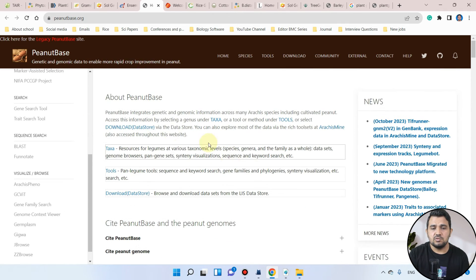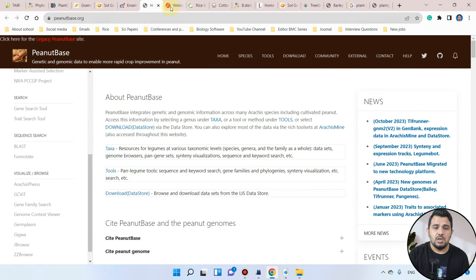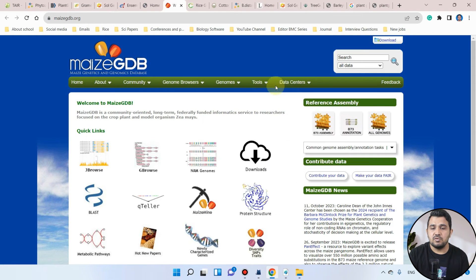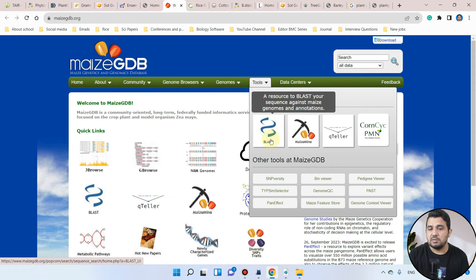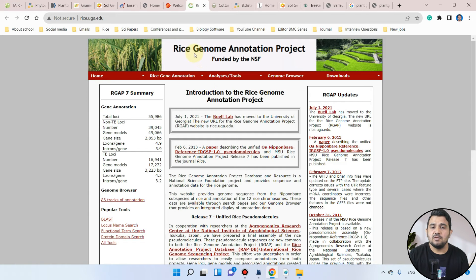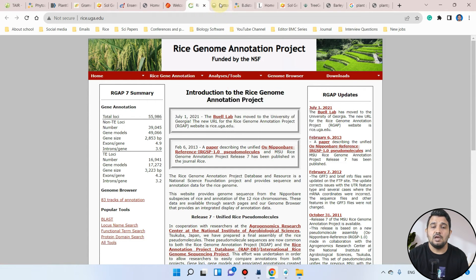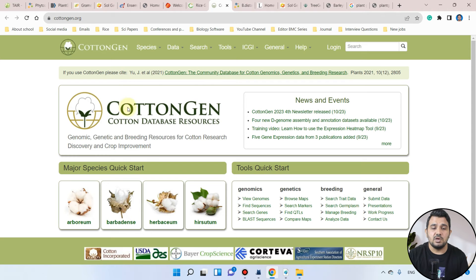We will also be using MaizeGDB, the maize genetics and genomics database, again using its BLAST tool. We will also be using the Rice Genome Annotation Project, where we can use the BLAST search tool. If you are searching for protein or gene families in cotton, you can use CottonGen, the cotton genome database resource, and again we will be using its BLAST tool.